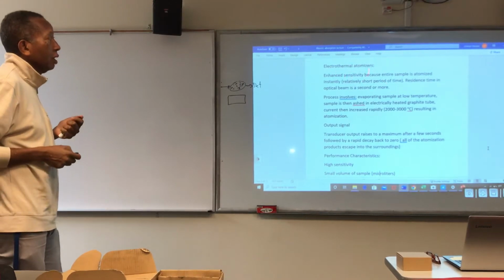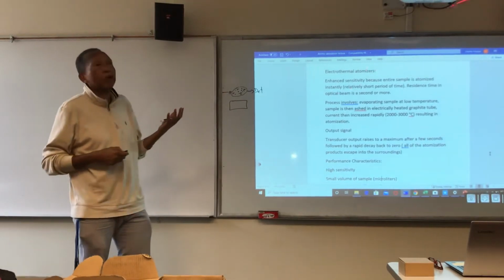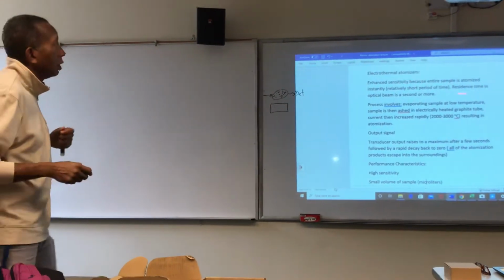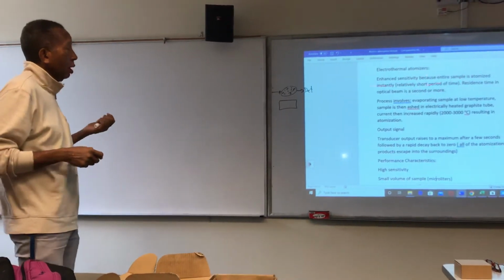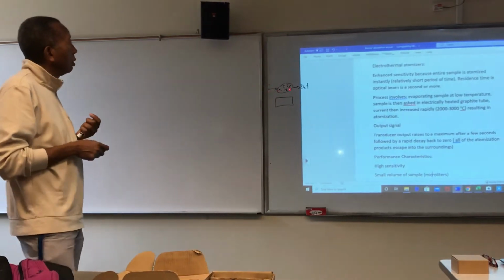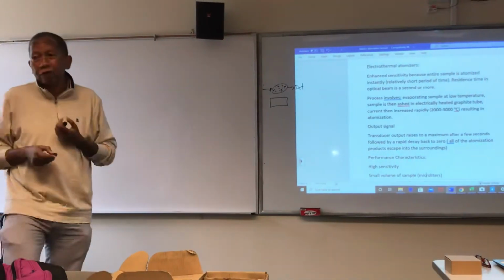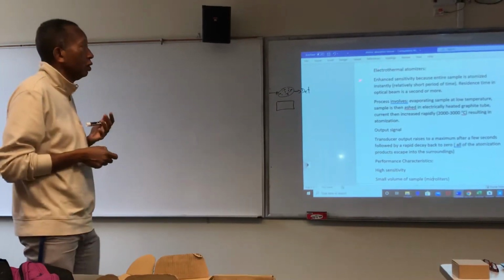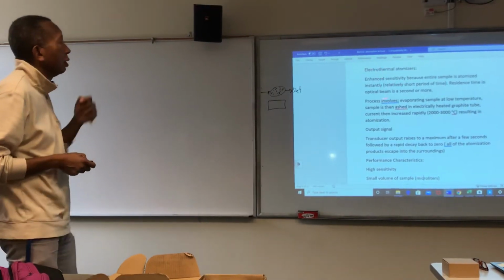This results in enhanced sensitivity, because the sample is there longer, so the sensitivity is greater. We can detect lower concentrations of the sample. It's because the entire sample is atomized instantly, and then it has a greater resident time in the beam of the source. Here we said it's a second or more. For the flame, we said it was something like 10 to the minus 4 seconds. So there's a huge difference there, so we can get better sensitivity.